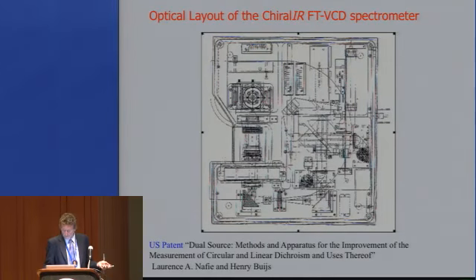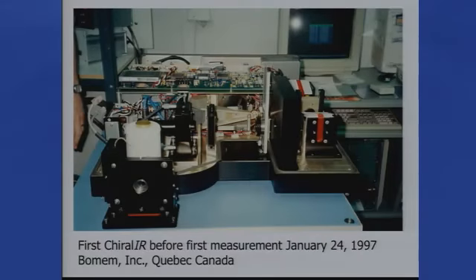So this was a big boost when we plugged that in and compared it to single mode operation. This is the FTIR spectrometer 2 days before its first use. The detector hasn't even been placed in the instrument yet, but the interferometer is back here. The beam comes along the side, goes through the PEM, and then through the sample chamber and is detected.